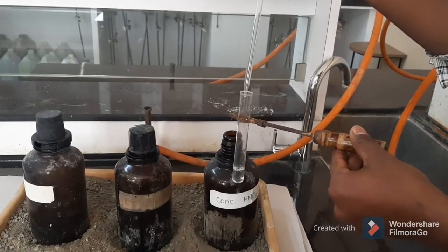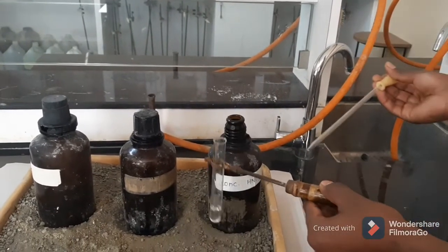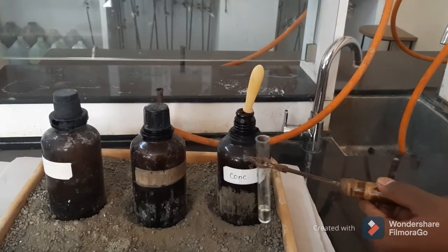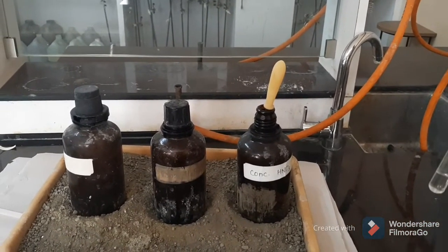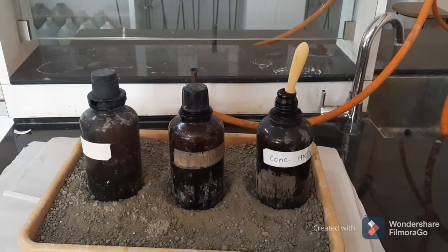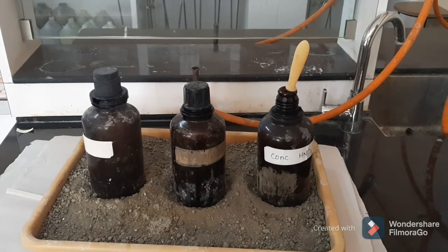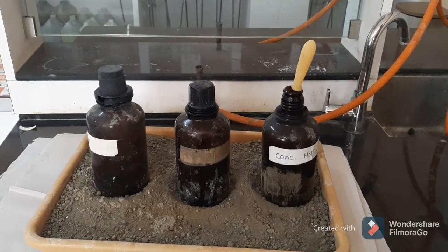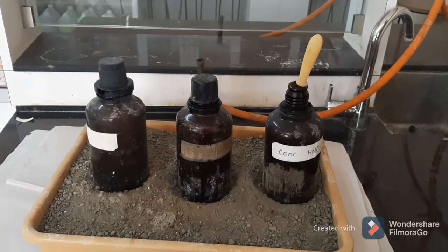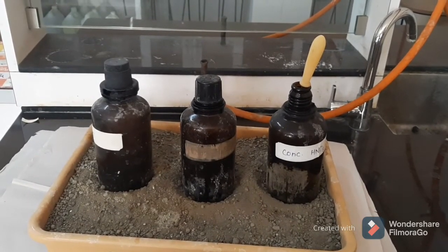If a small amount of acid falls on your skin, first wipe out that acid with a cloth, napkin, or filter paper, and then wash your skin under tap water. Do not wash immediately with water — it will react with the acid and you will get a burn mark on your skin. First remove the acid with filter paper or cloth, then wash the skin under tap water.